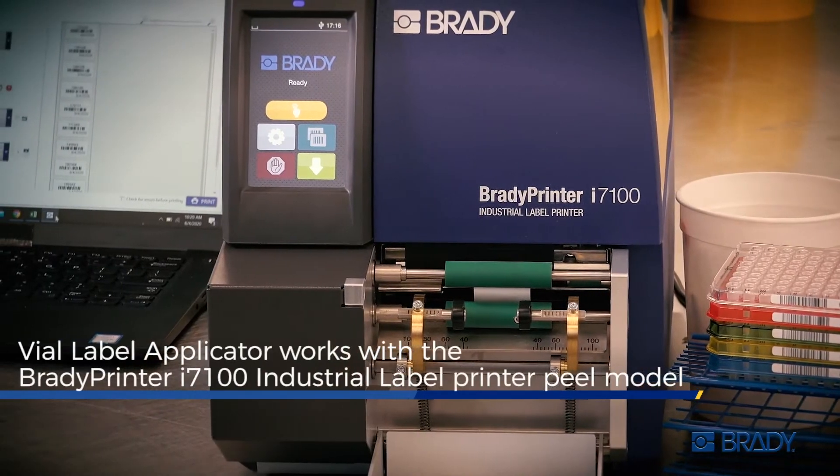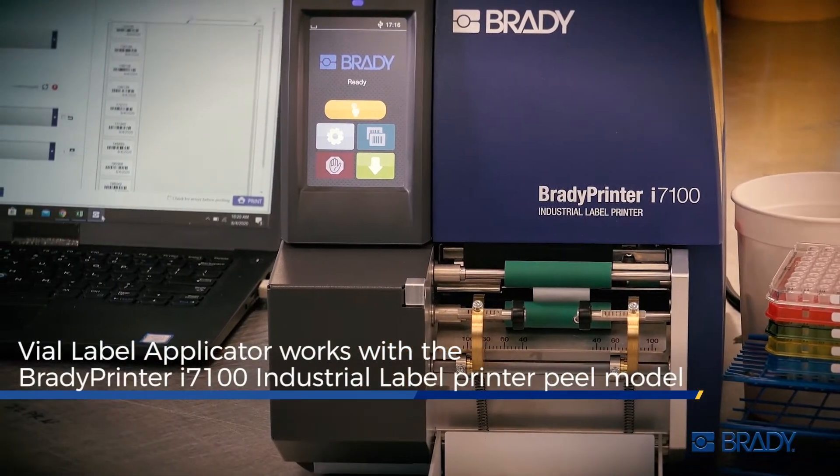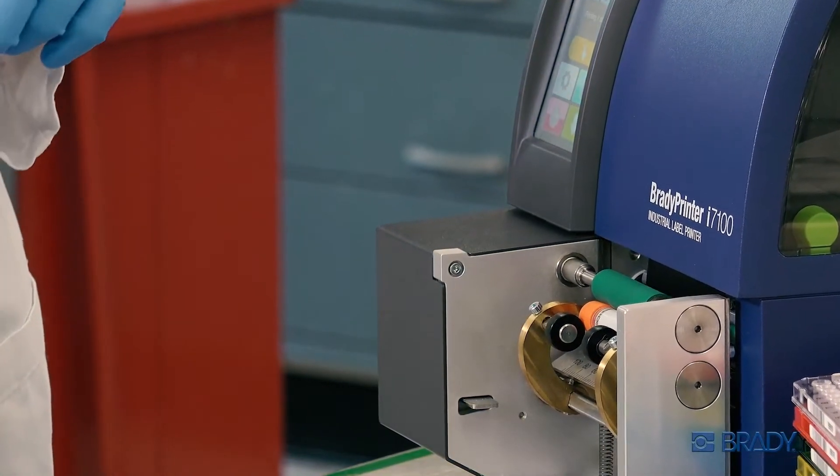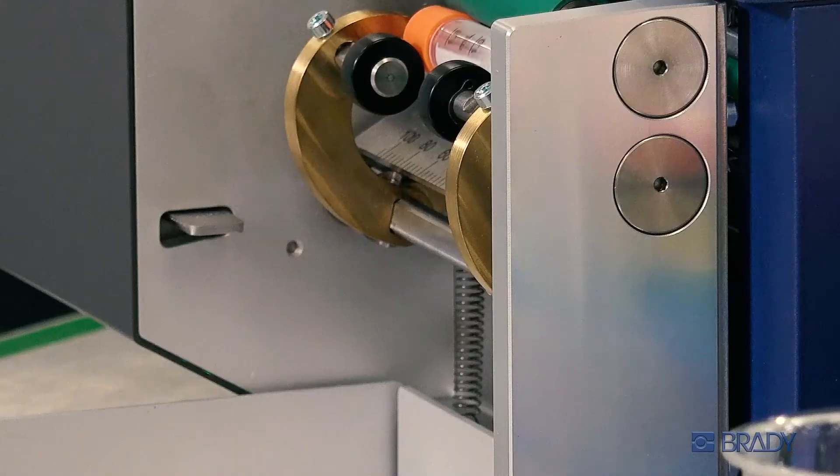Put Brady's Vial Label Applicator in the mix with a Brady Printer I7100 Industrial Label Printer. Together, they're the key to unlocking lab efficiency like never before.